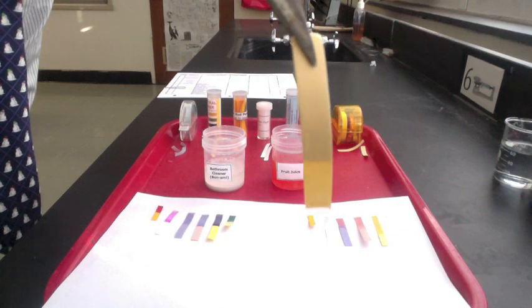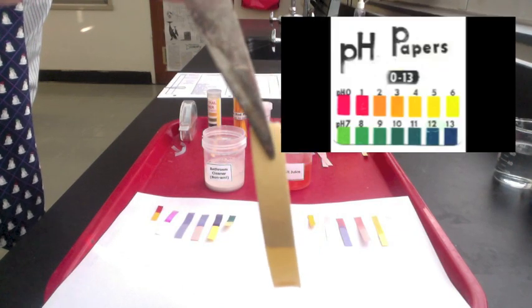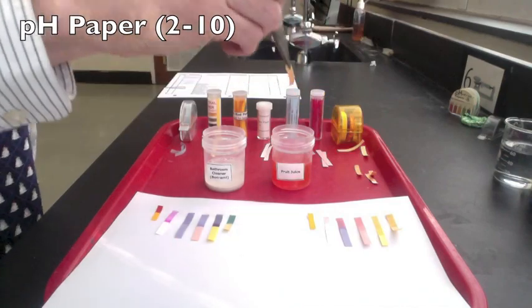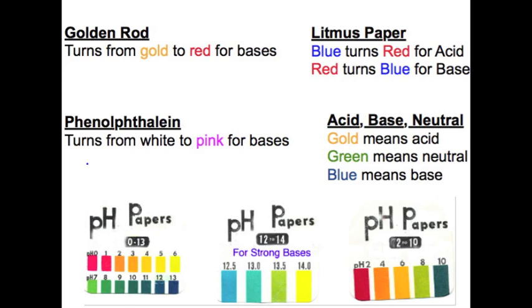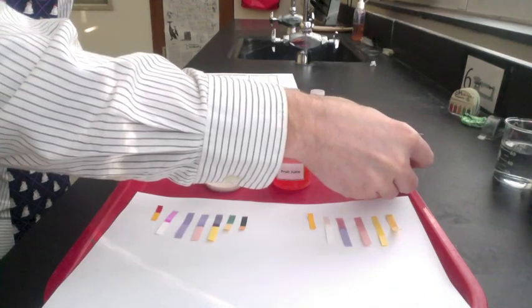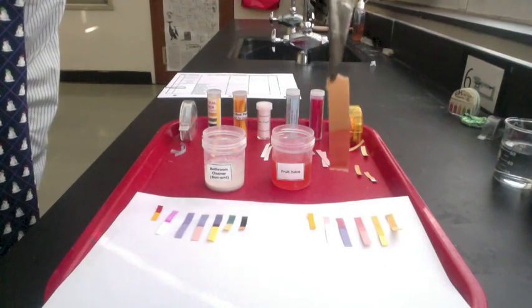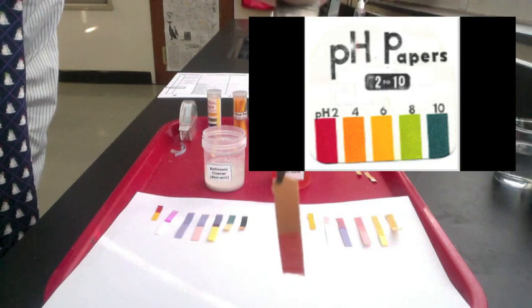Dipping the pH paper for 0 to 13 in the fruit juice, it looks like a yellow color, which indicates a pH of 5. Another kind of pH paper is for the pH between 2 and 10. The cleaner shows up as a dark blue or purple, which indicates a pH of 10 or higher. Dipping the pH paper for 2 to 10 in the fruit juice, it comes up orange, which indicates a pH of 4 or 6.